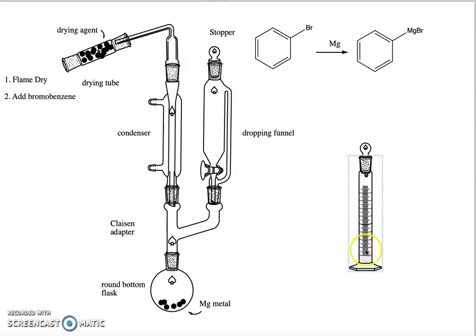Then we're going to bring it over to our glassware, which is also still stoppered. As quickly as possible, we remove the stopper from the dropping funnel and the stopper from the graduated cylinder with the bromobenzene, and we add the bromobenzene to the dropping funnel.